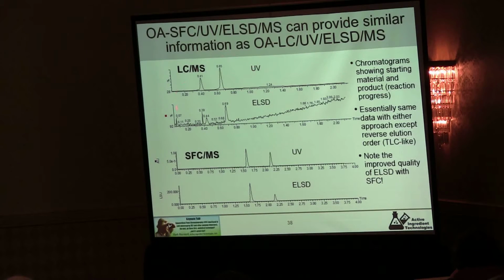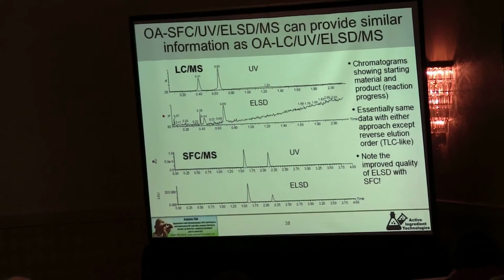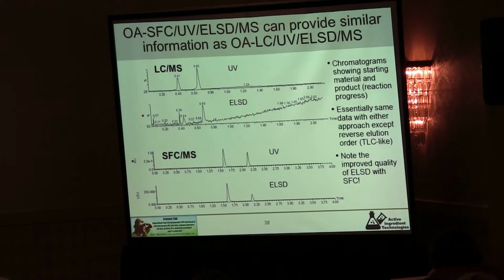Here's another example, and here's where the data often looks the same. So very frequently you can take SFC and LC and compare the data, and this is often what you see. You have an impure mixture here using the technique you're comfortable with, and you get essentially the same chromatogram with SFC, except the peaks are reversed. Right? So it's the same chromatogram, but like you printed it out on one of those old transparencies and flipped it over. And again, you actually see the difference in the ELSD here. So these are eluting at fairly high water concentration, so the ELSD doesn't look so good, whereas SFC, perfect.